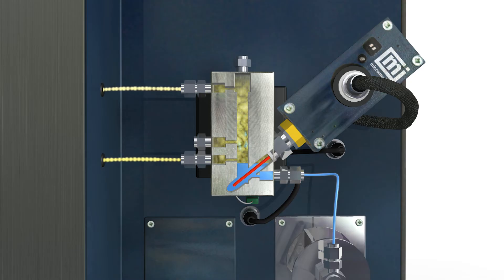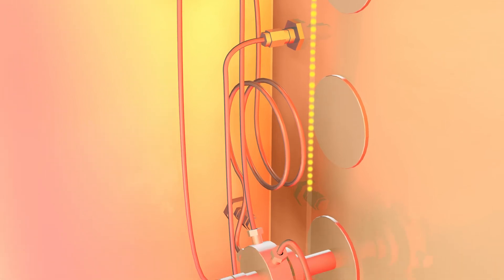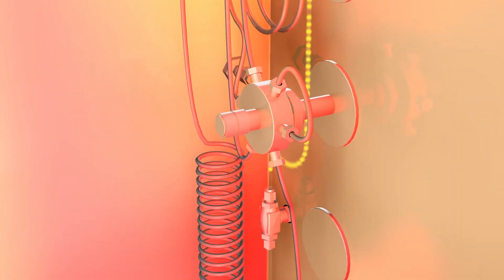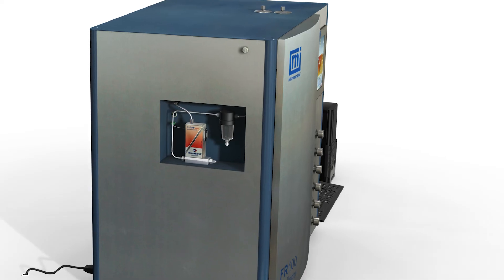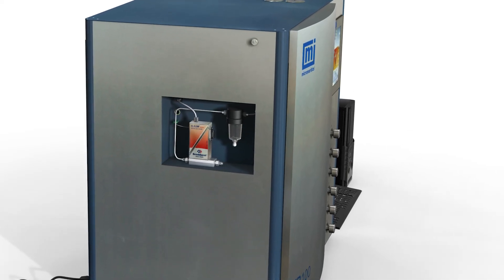The gas and liquid are separated and after passing through the pressure control valve, it is measured in a mass flow meter.